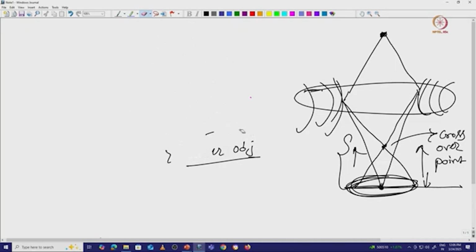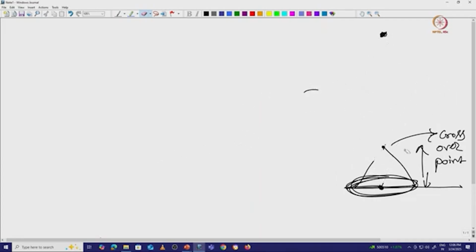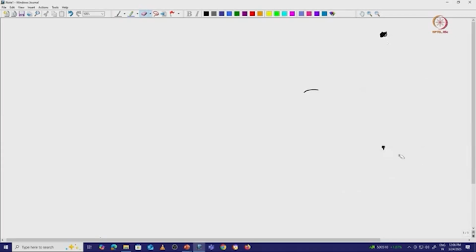In electromagnetic lenses, first let's discuss how this works. Consider that we have a magnet with a north pole and a south pole, and there is a magnetic field. Sorry, I drew it in the wrong position, I will redraw.